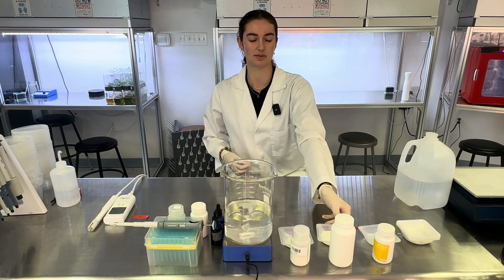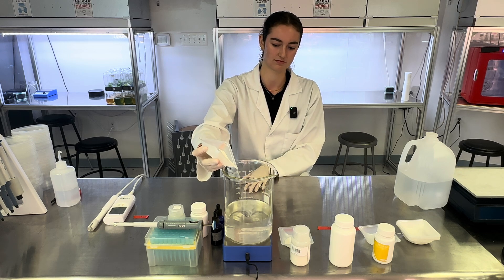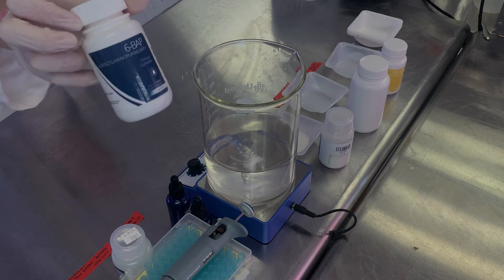After, we'll add 30 grams of sugar that you can get at a grocery store. Then I'll add 1 milliliter of 6-BAP, which is a multiplication hormone.